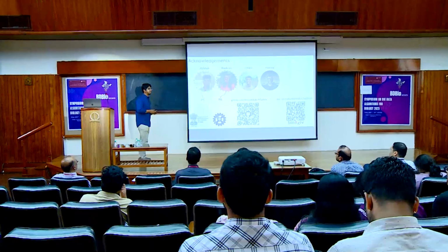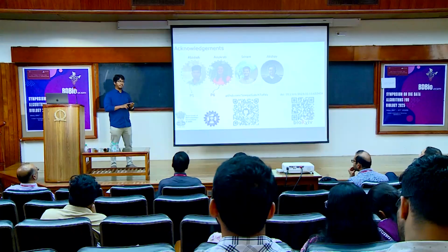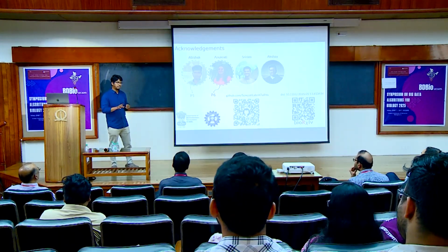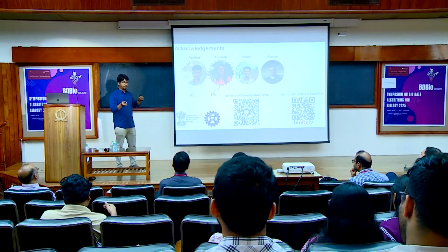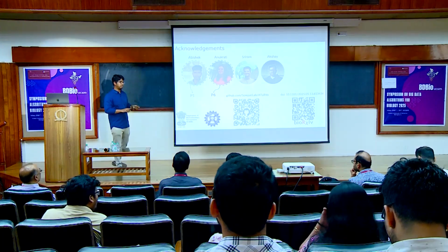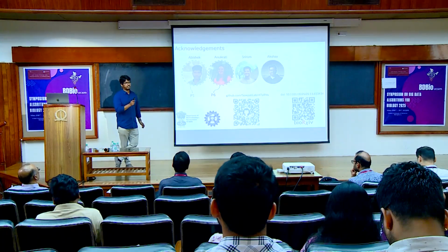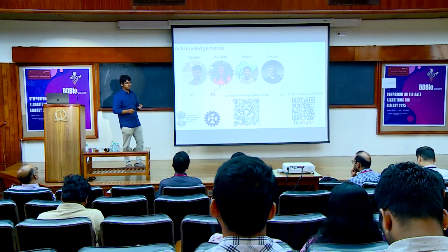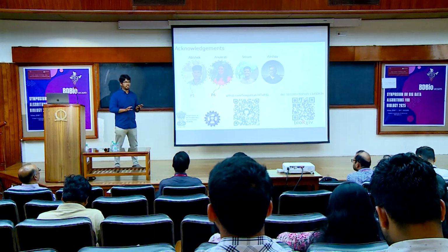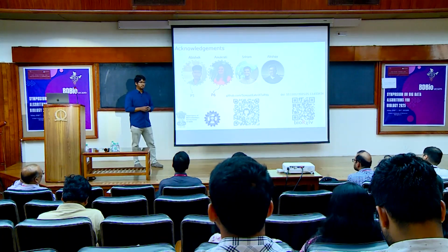Great question. I'm glad you asked this. So everything that I've shown is single-threaded performance, one thing. Second is, alignment is something that you cannot take out from any pipeline. You will have to do the alignment part. SNP calling you don't have to do. If it's haplotagged, we use that information. Otherwise, we identify the SNPs on our own. That 2.9 million loci for a 30x data set using 4 CPU cores, we do in about 15 minutes. So that's on a normal desktop computer. It doesn't need high-grade servers, it doesn't need GPUs, none of it. So that's the speed.